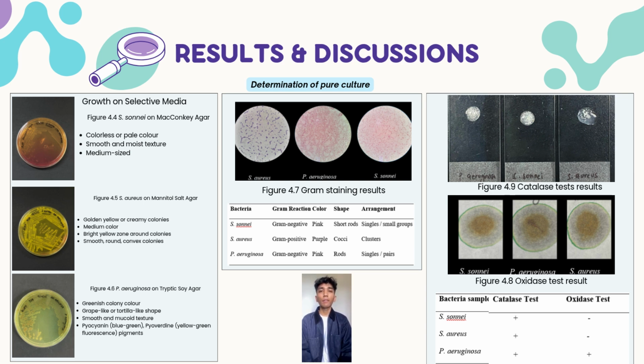Catalase tests were positive for all 3 bacteria, indicated by the bubbling after adding hydrogen peroxide, and for the oxidase test, P. aeruginosa was positive, while S. sonnei and S. aureus were negative, consistent with their known respiration pathways.